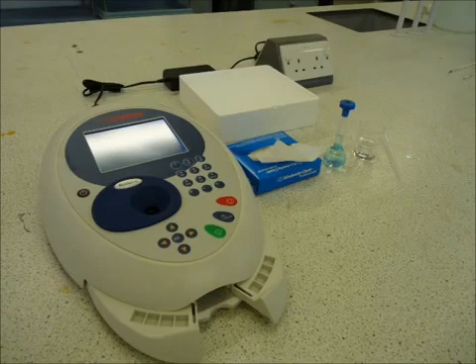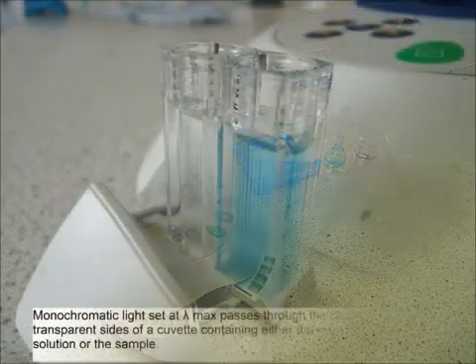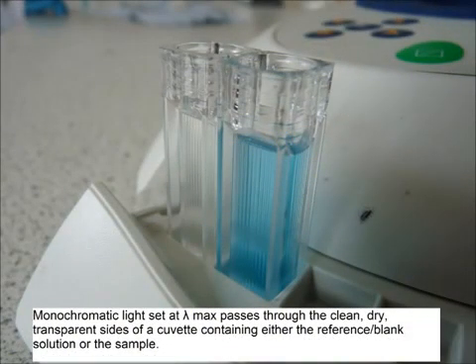UV visible spectroscopy is a method of quantitative analysis and it can be used to determine the concentration of a solution once a calibration curve has been performed. The procedure is based on the amount of light absorbed as it passes through a sample.